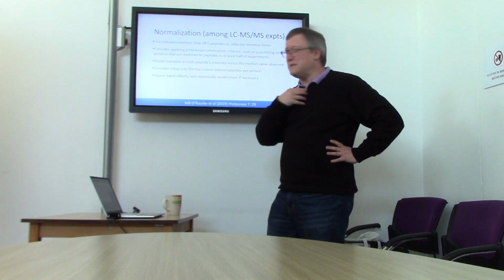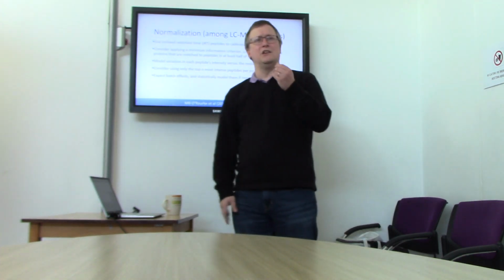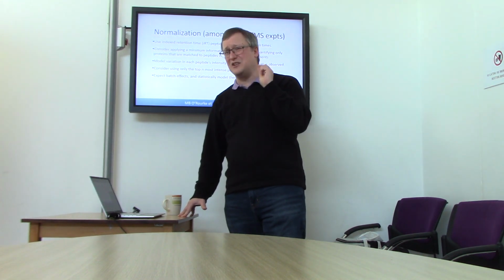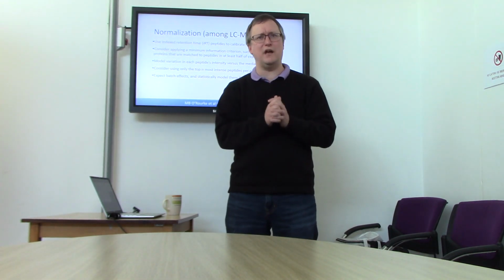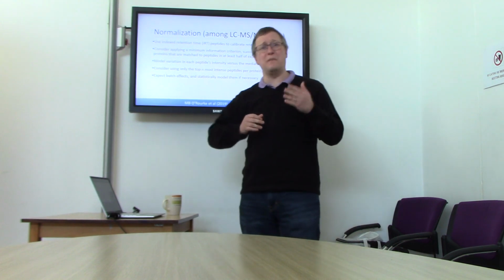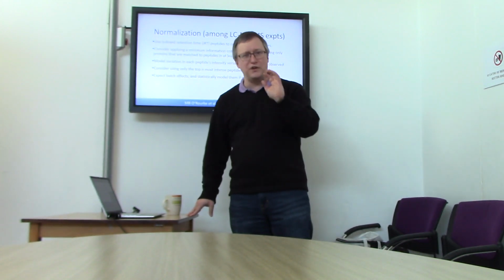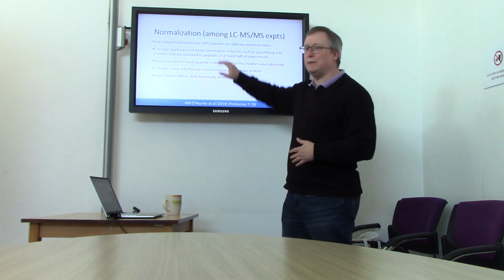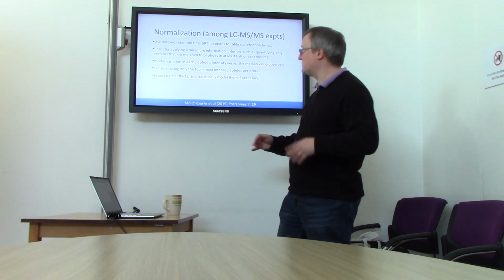You might also think about what I typically call a minimum information criterion. It's a kind of an overblown term for a simple concept. You should probably consider that trying to quantify everything you identify is probably too big an ask. It's probably a little bit too messy for you to attempt to do that. A lot of the proteins you identify have very, very little evidence, very little consistency in the evidence for them. As a result, you might want to put in a criterion that says, if I didn't see peptides for this protein in at least half of my experiments, I will not try to compute a differential statistic on it. I'm not going to run a t-test on it. So I think that being able to rule out proteins to focus on just those that have enough information for making quantitative statements about is appropriate.